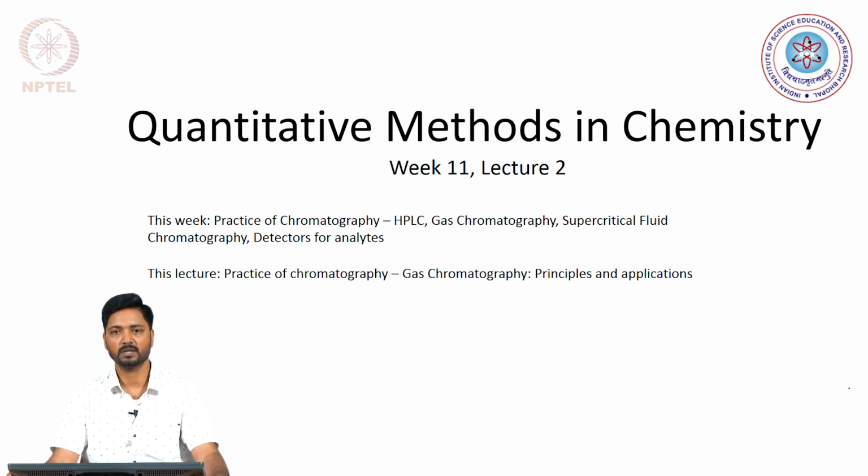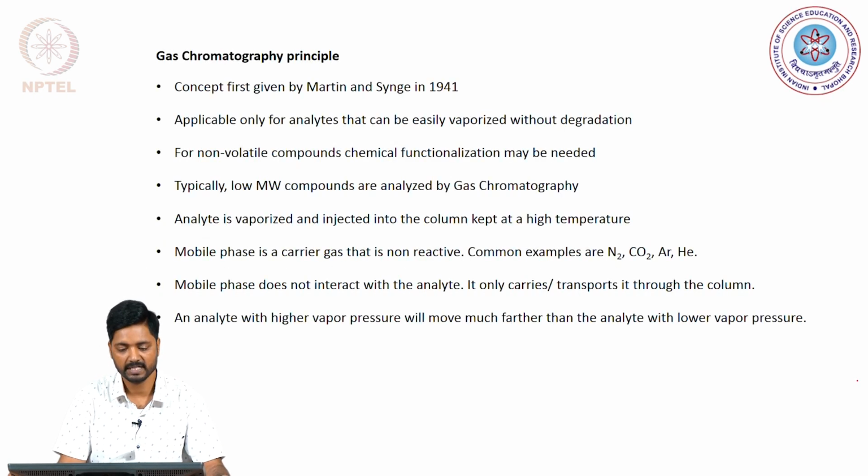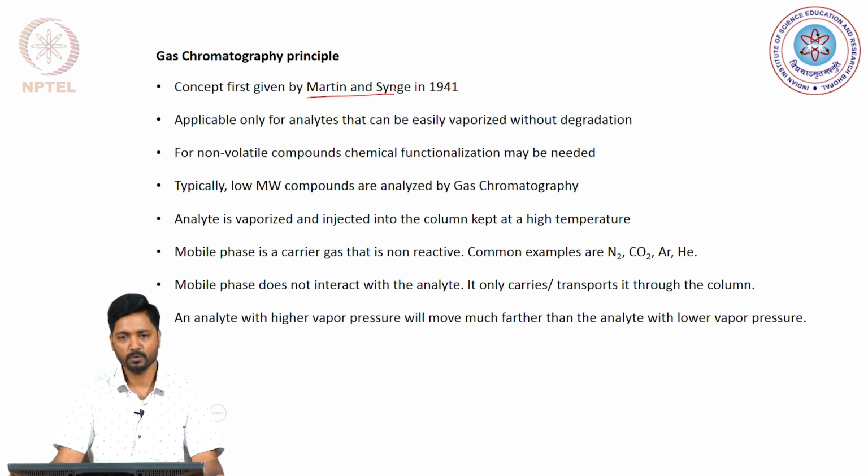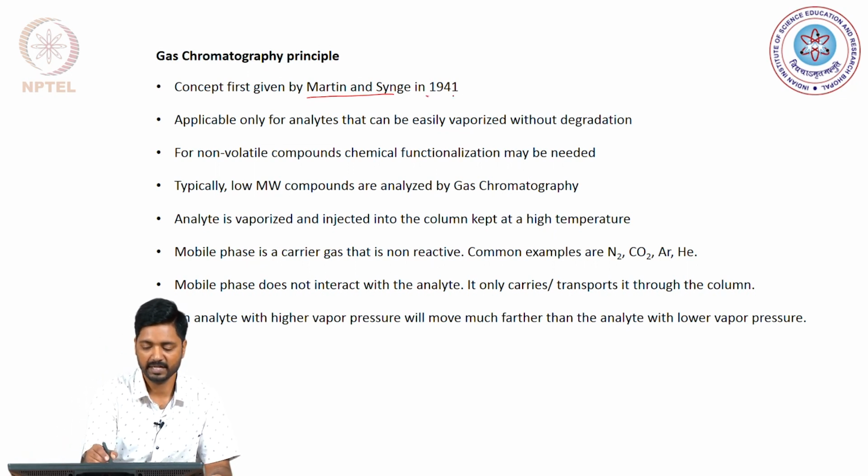So, let us get started with this week's lecture 2, and let us first have a brief introduction about gas chromatography. Chromatographic techniques, as we have been studying, were mainly developed through the efforts and the theoretical framework developed by Martin and Synge. They proposed the concept of gas chromatography in 1941.